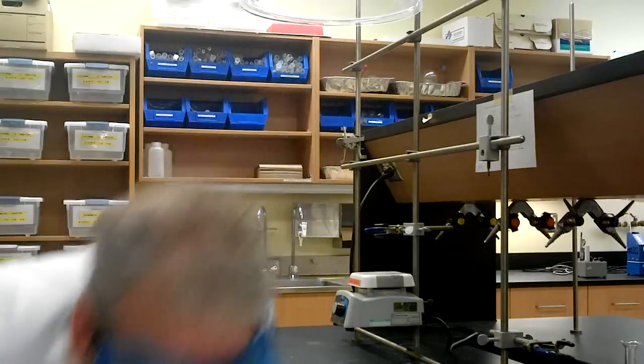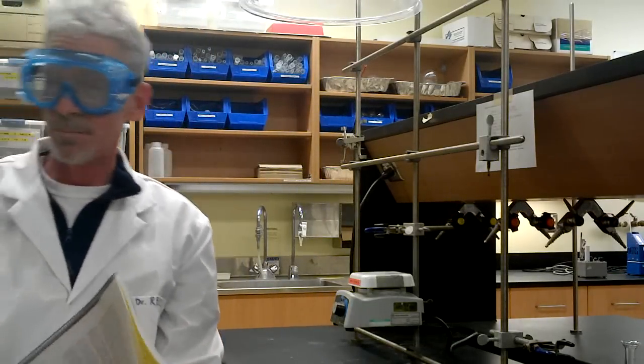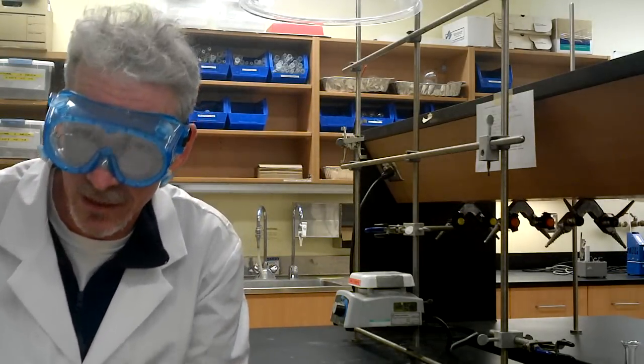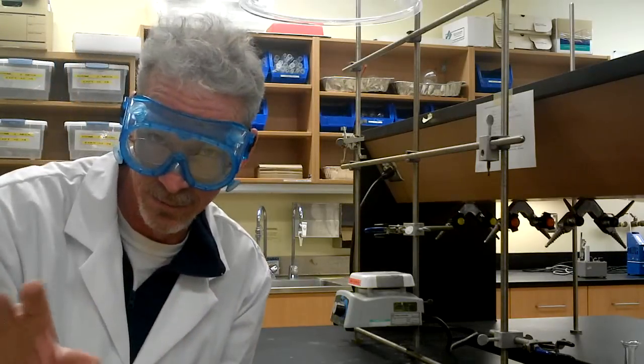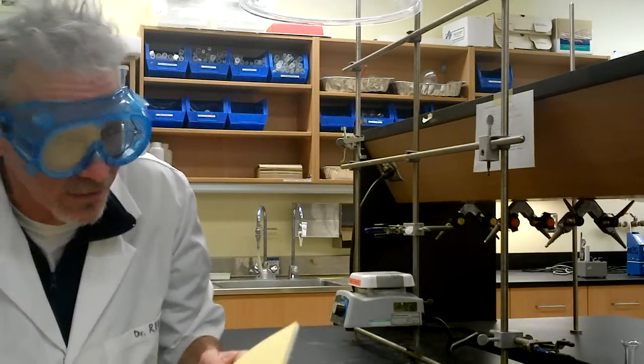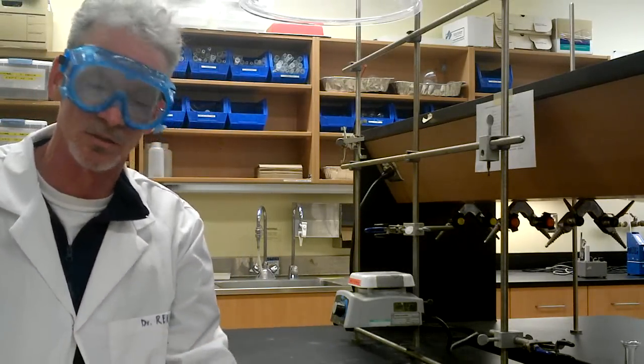Welcome to experiment 7, the nitration of methylbenzoate. Benzoate being an ester, it's the methyl ester of benzoic acid. Acids become -oate when they're esters. I don't know why, but that's the way we do it.